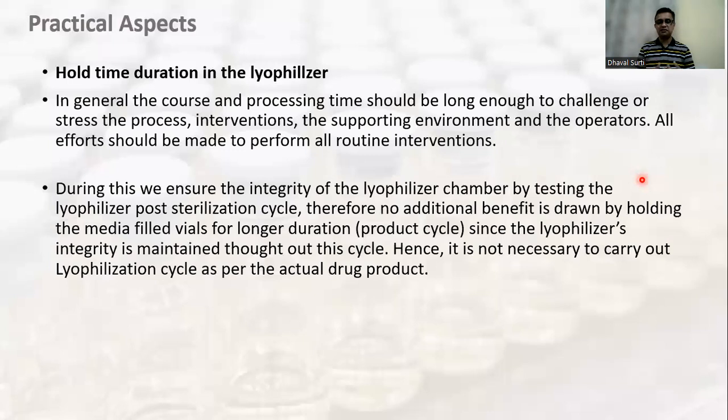During this, we ensure the integrity of the lyophilizer chamber by testing the lyophilizer's post-sterilization cycle. Therefore, no additional benefit is drawn by holding the media fill vials for a longer duration, since the lyophilizer's integrity is maintained throughout the cycle. Hence it is not necessary to carry out the lyophilization cycle as per the actual drug product. So there is no point in holding the media inside the lyophilizer, because once you close the chamber, it is integral.